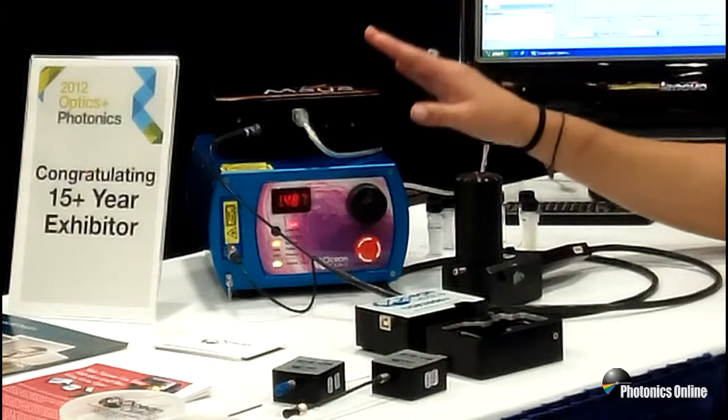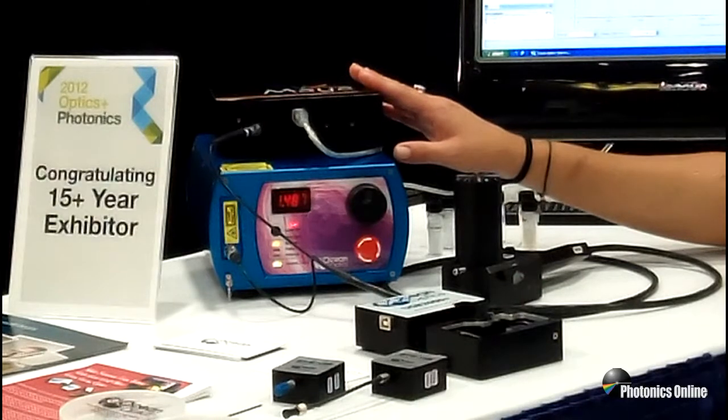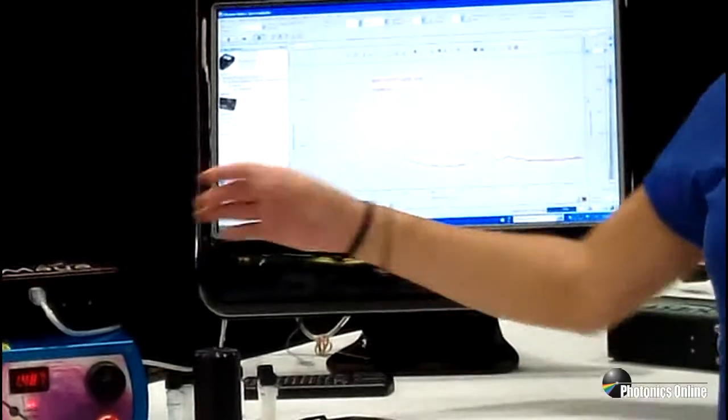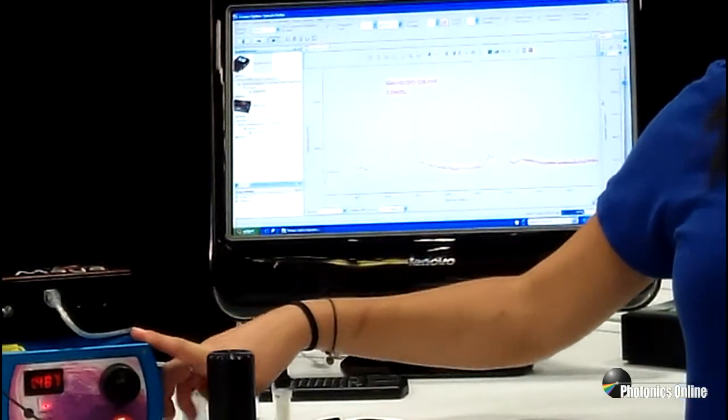So we are able to actually do Raman in the NIR without having to use a TE-cooled detector such as the QE65000. As you can see right now, we are doing a Raman signature with the Maya using a 785 nanometer Raman laser.